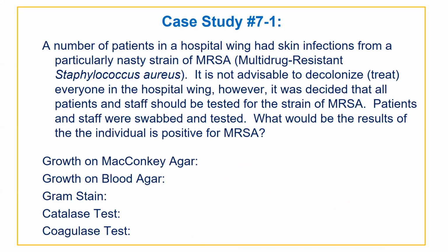So Staph is gram positive. That means there's not going to be any growth. So that's a quick test. Put it on MacConkey agar. There are agars that select for gram positives only, but we haven't really discussed them. So MacConkey agar is worth it to mention.